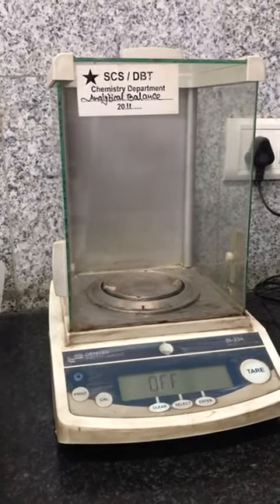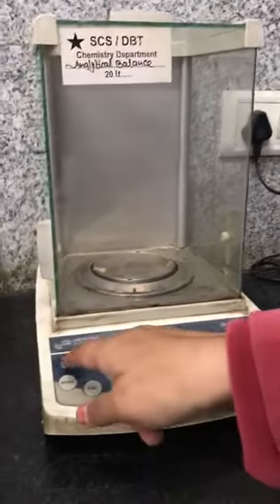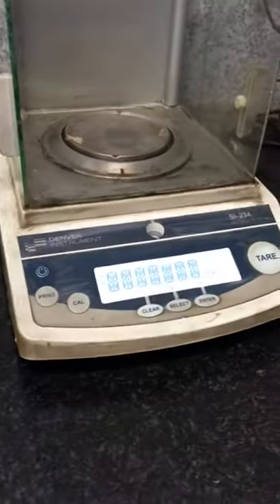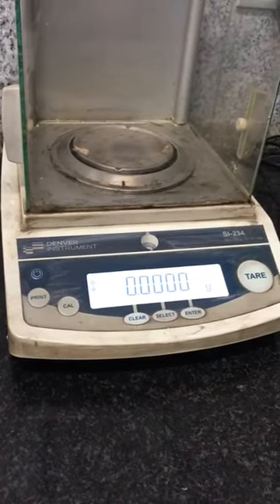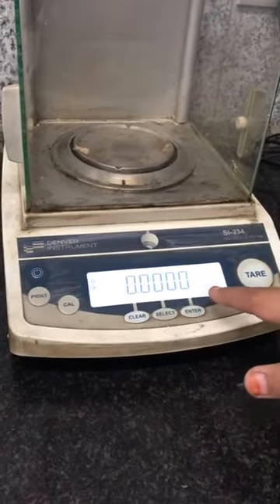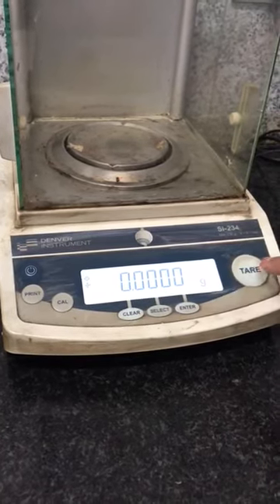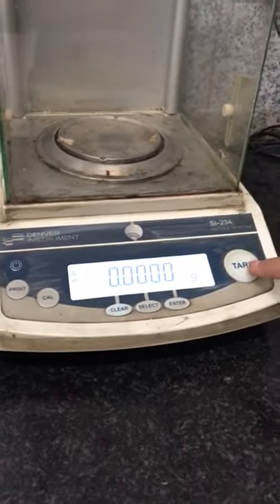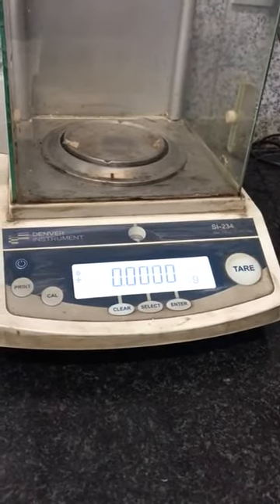I have switched on this button — you have to switch on this button. Then you have to turn on this weighing balance system. You should get all zeros on the display. Here the 'g' stands for gram. Whenever you are putting something, you have to tare it, so that the background weight will be nullified.